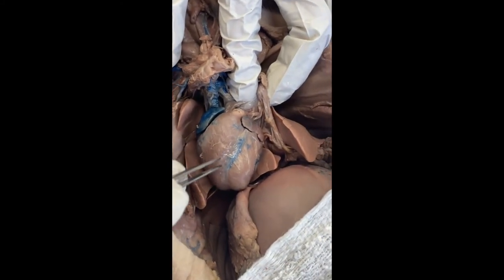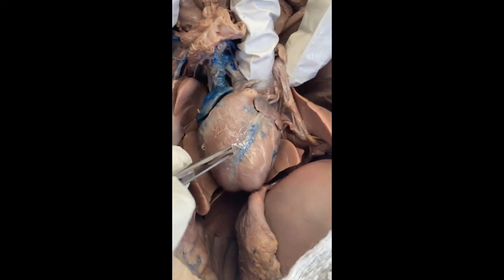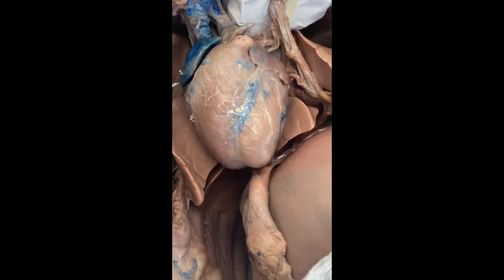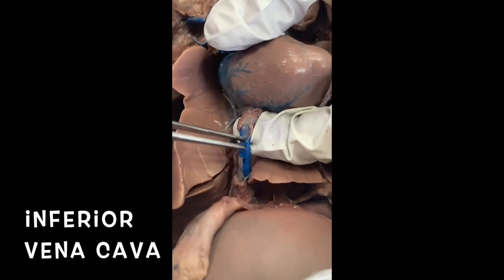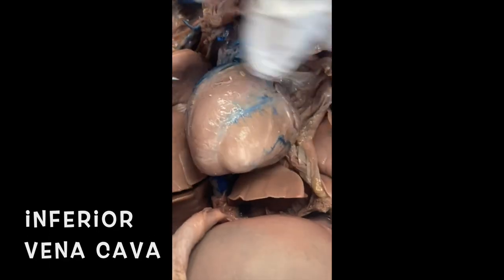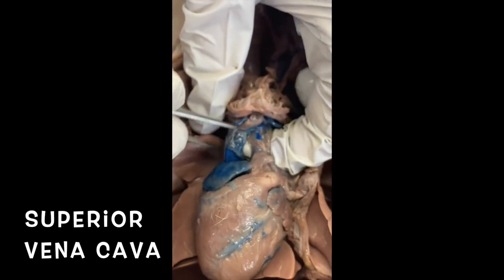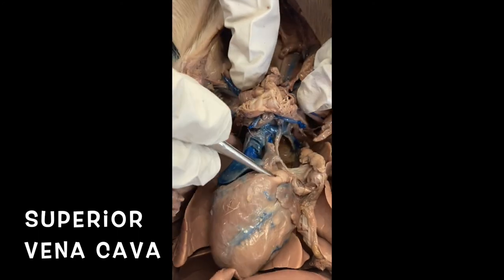We do have veins and arteries that sometimes don't come across dyed correctly, but we do have coronary arteries and veins that go throughout the heart. Here we're only seeing a lot of blue. I'm gonna show you a major vein here below. So here's the heart, and then we have one here below. Here's the inferior vena cava. We have veins up here. Superior vena cava would be one above. And we have the aorta here.